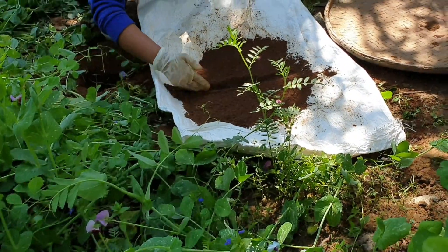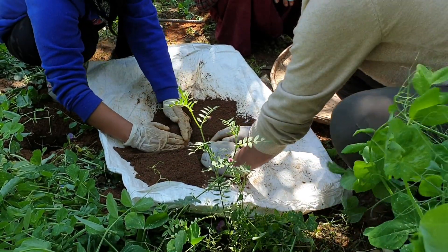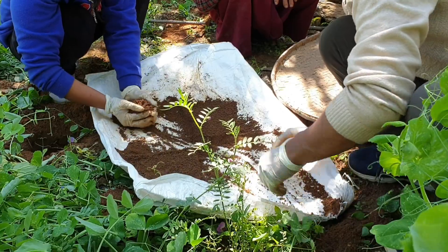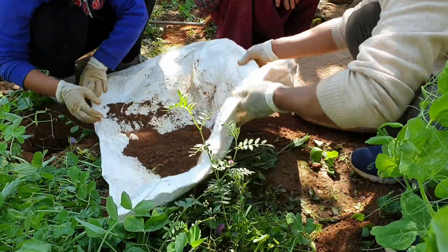An important step in sampling is the removal of excess soil from the sample. For this, divide the sample into four quadrants and remove the soil from two opposite quadrants — this is known as the criss-cross method.